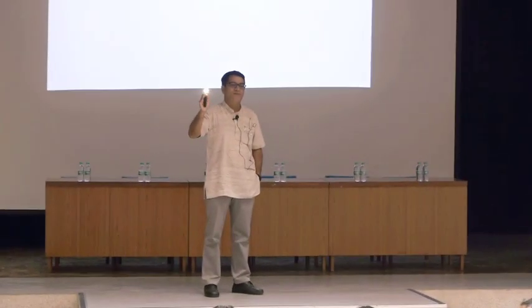Before there was a lot of controversy. Some believed that this is S1, some did not, because their resolution was poor. This is the first time we showed that S1 is involved in stabilizing the hibernation promotion factor, because here the resolution is somewhere around 5 angstrom. You cannot build ab initio, right? Otherwise you have to do secondary structure build, then loop build. Better is we have AlphaFold, take it and dock it.